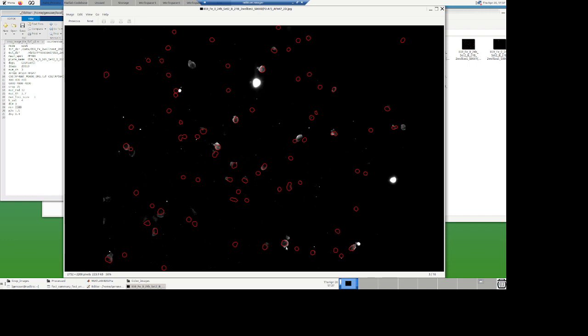And, you know, irregular is not circular. So you can see if I were to crop here and compute the intensity, I may miss that positive cell. I don't truly think it will miss it because there's still some bleeding anyway in there. So those will be positive cells most likely. And those will be completely negative.